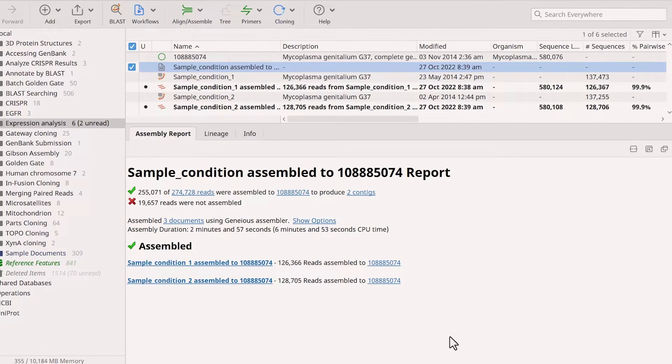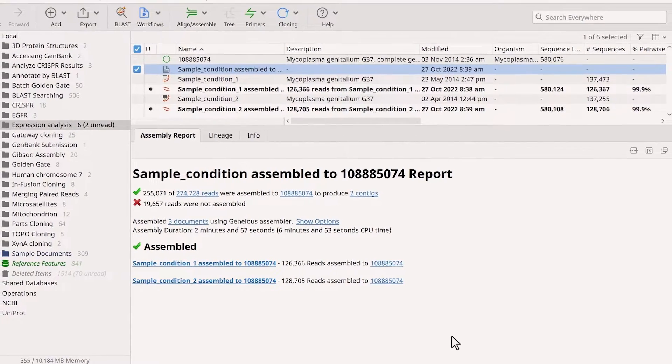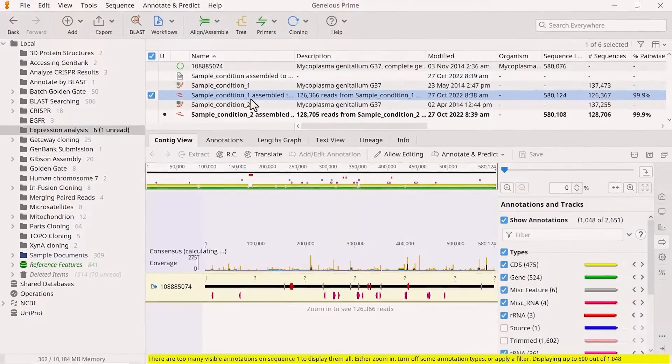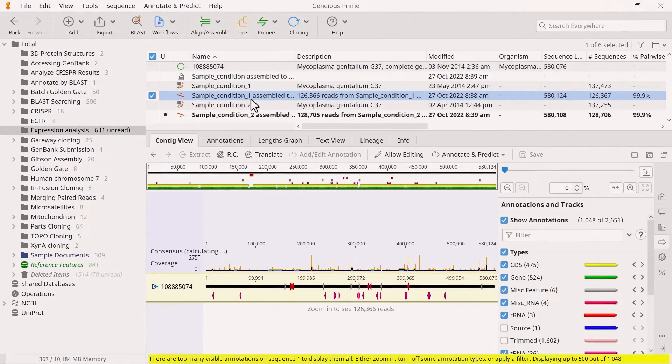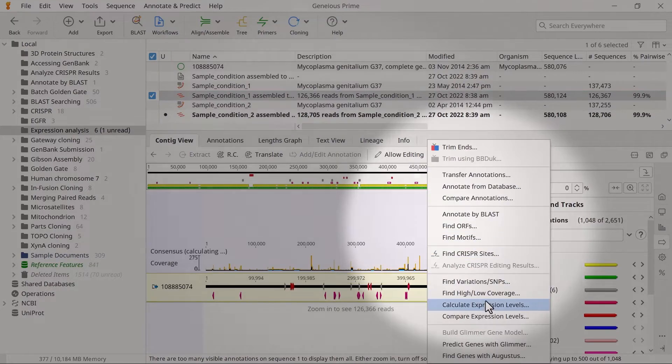Next, use the assembly files to calculate the expression levels of the different genes in each file. To do this, select an assembly file, go to Annotate and Predict, and choose Calculate Expression Levels.